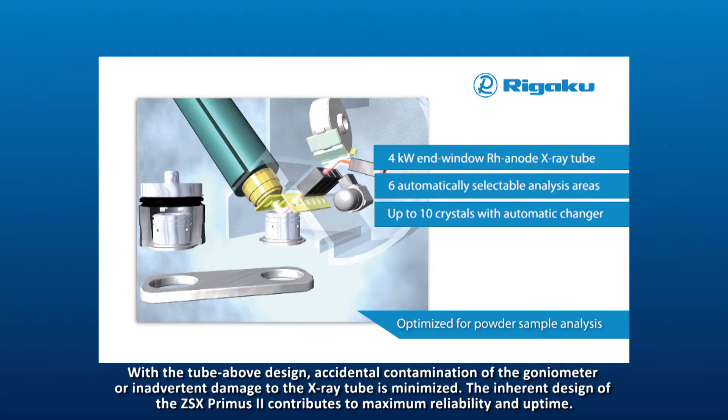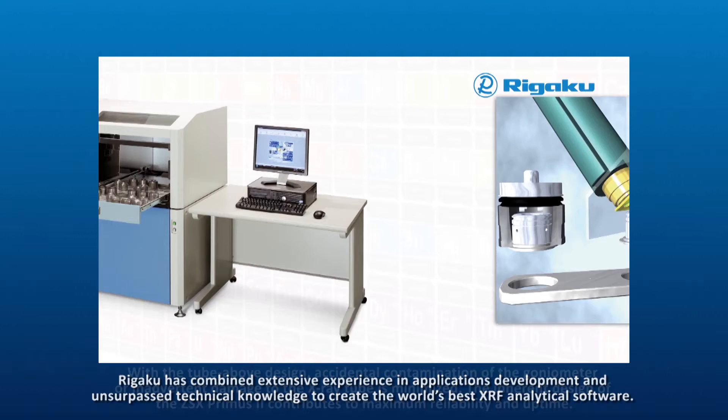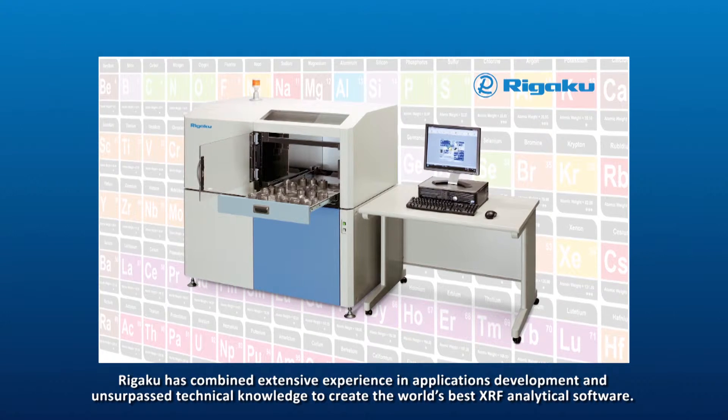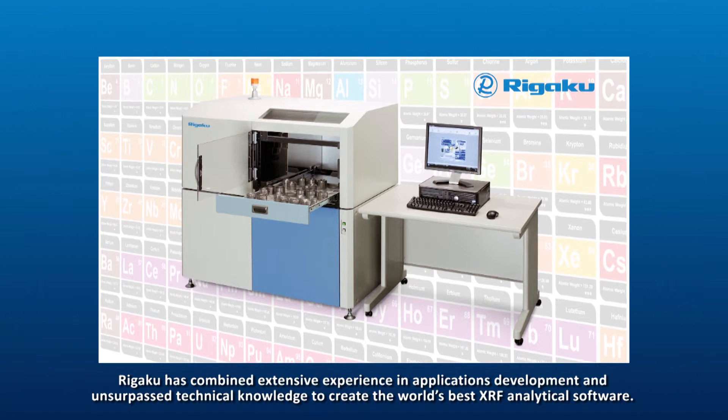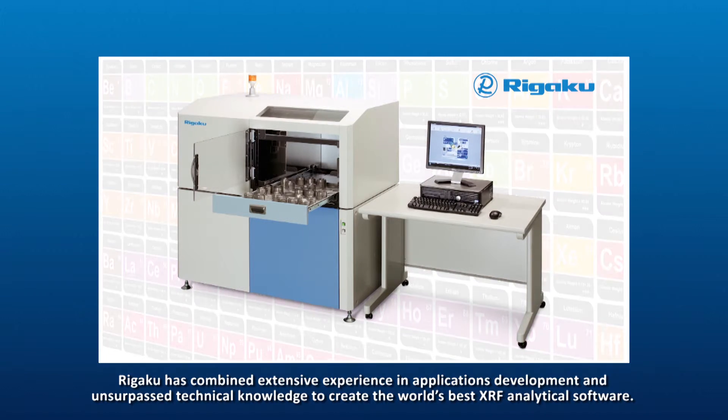The inherent design of the ZSX Primus II contributes to maximum reliability and uptime. Rigaku has combined extensive experience in applications development and unsurpassed technical knowledge to create the world's best XRF analytical software.